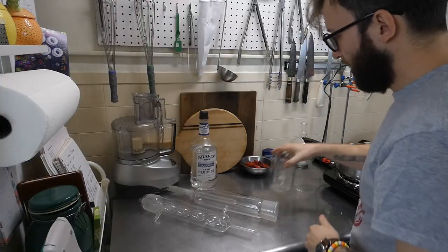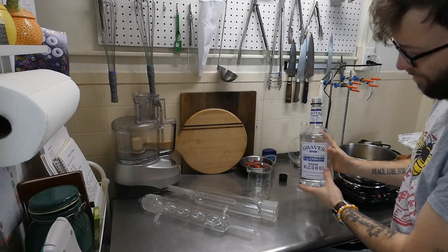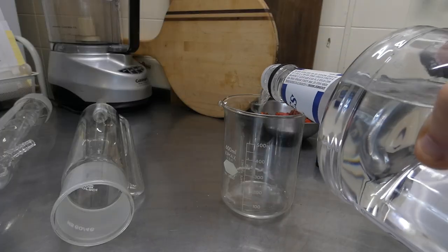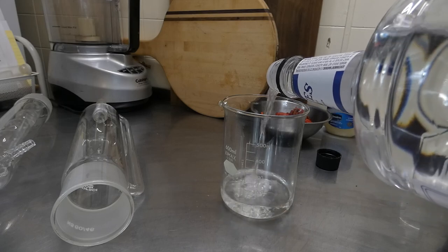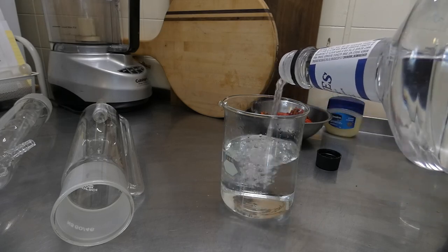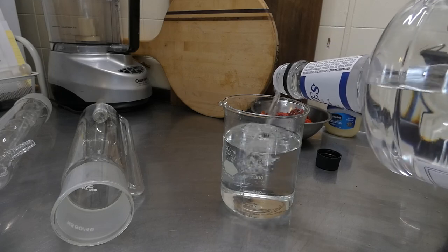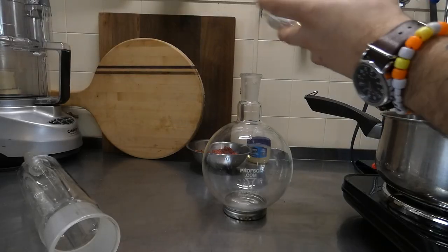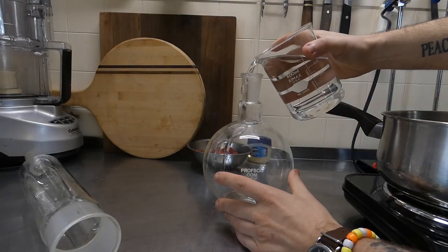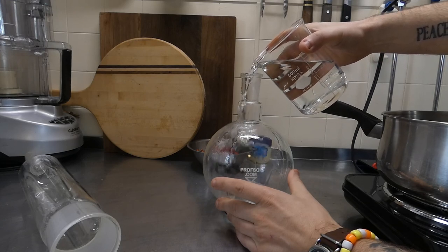All right, now we're gonna measure out about 400 milliliters of grain alcohol. And we're gonna take it and we're gonna pour it right into this flask. Try not to spill any like I just did. You could also use a funnel here, it would help.